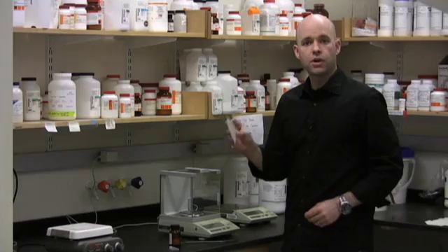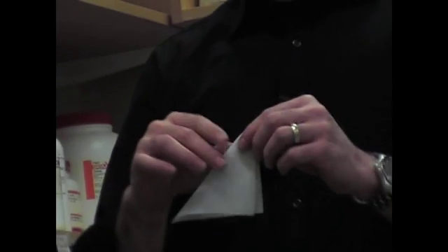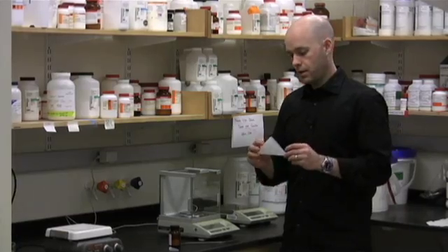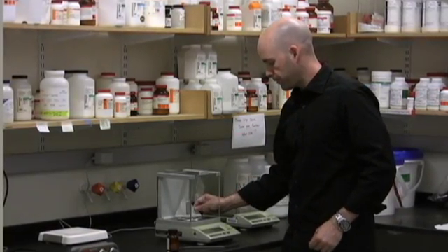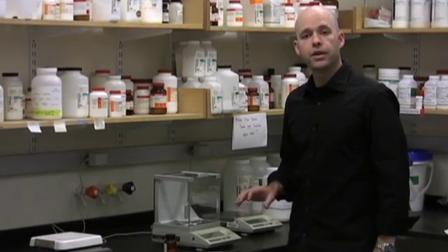The first thing to do is start with a weigh paper and you want to crease it diagonally. Just fold a sharp crease right down the middle of it. This is what you're now going to put on to the scale.